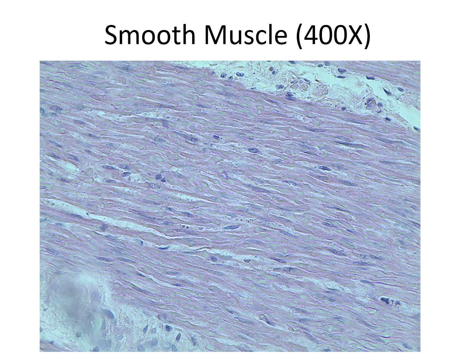Smooth muscles look a lot like dense regular connective tissue, but the difference is you will see way more cells, because everything that you see is actually cells that are pretty close to one another, and they're spindle-like.